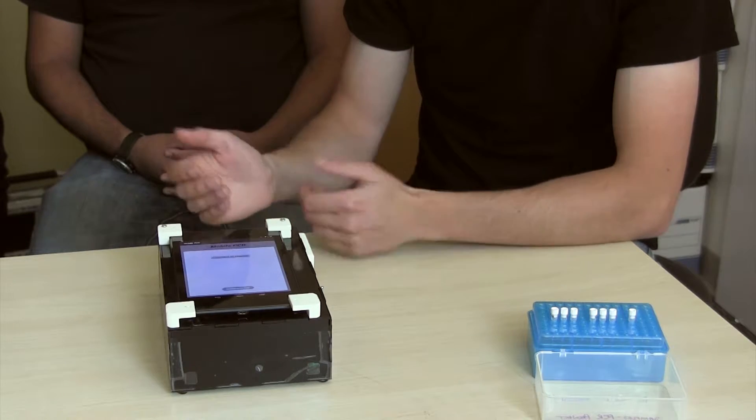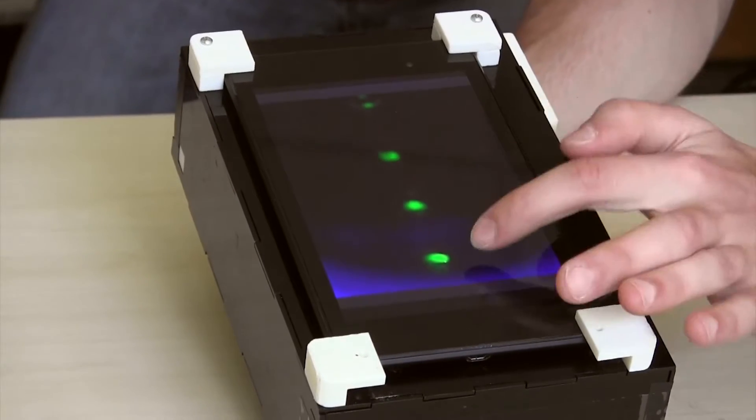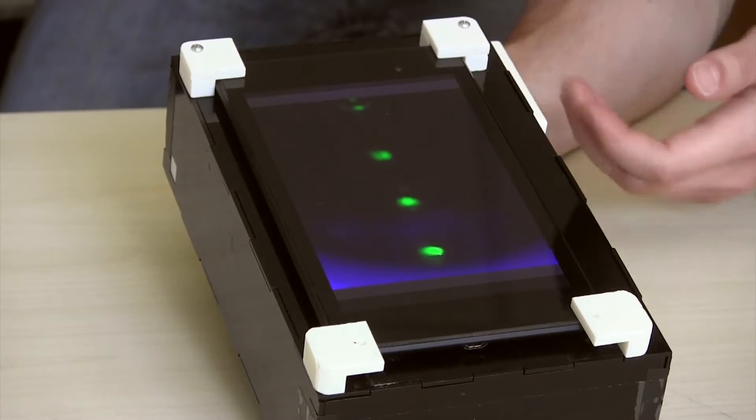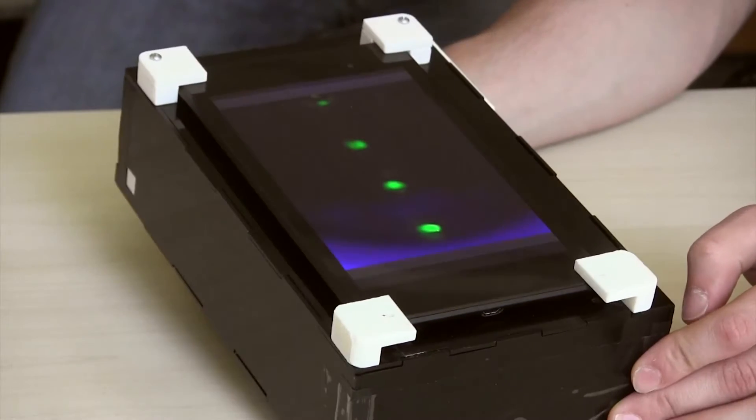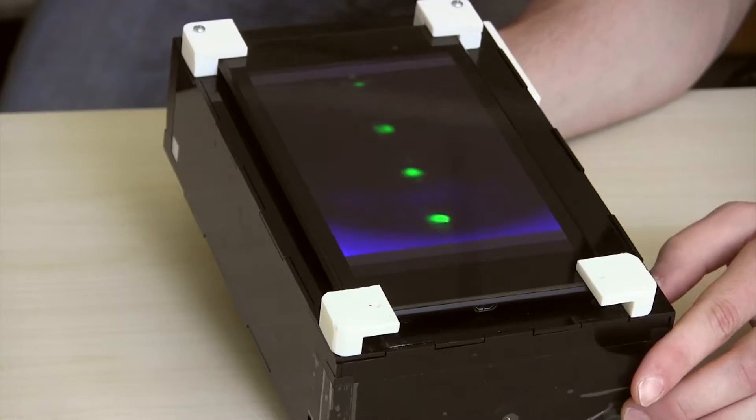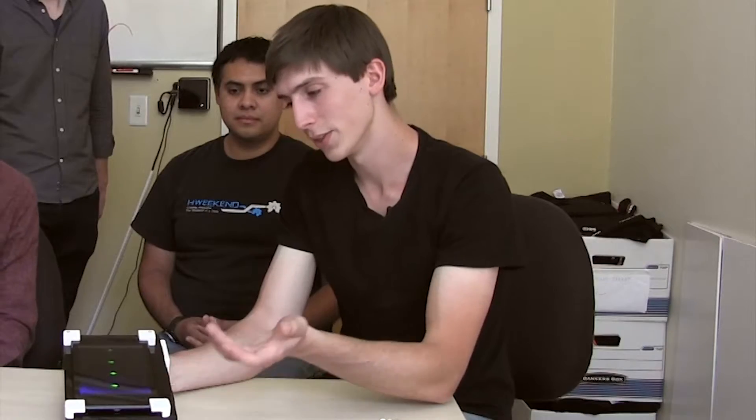This is what the samples actually look like to the tablet. You can see each of these green dots represents a sample, except for one of them which is for temperature measurement. The tablet can actually go through and analyze these dots to determine how green it is, so that determines relative fluorescence, and that's what we're actually measuring.